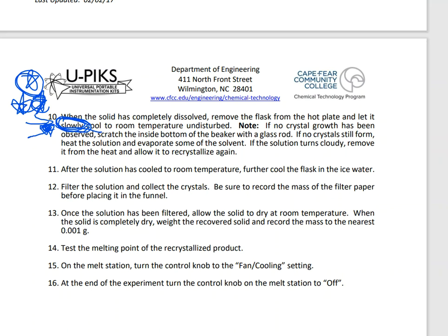Why is this important? Folks, again, I've got this container, maybe a beaker, maybe a flask. I've got this solution in it of hot water. I want my solution to slowly cool so that way the impurities can stay in solution. And then my product will slowly start to form crystals here on the very bottom. They're not rushed. They're not stressed. They've got plenty of time in the world to solidify on the bottom. And I'll see that in terms of a precipitate.